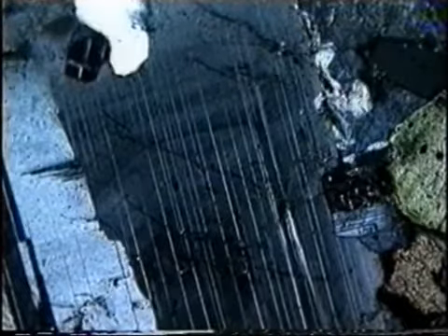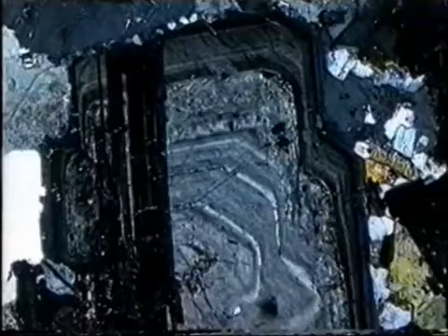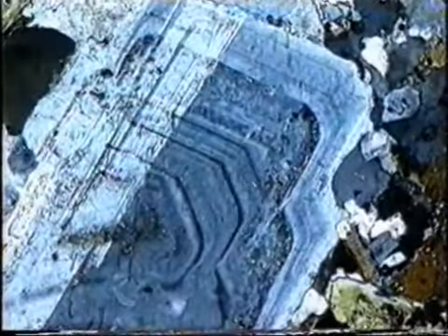A sharp composition break can occur near the rim, as shown by this sudden change in extinction angle. Oscillatory zoning produces these concentric zones parallel to the crystal faces. Another example of oscillatory zoning, it's a bit like the growth rings in a tree trunk. It indicates crystallization from a melt.